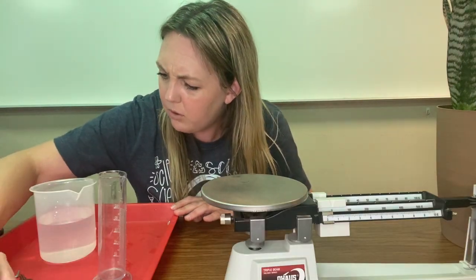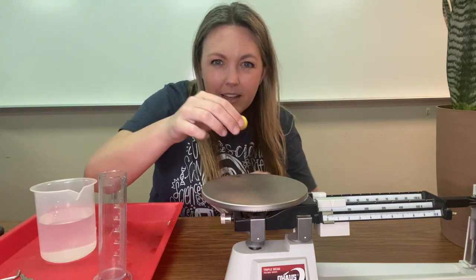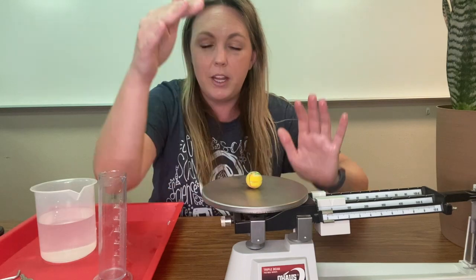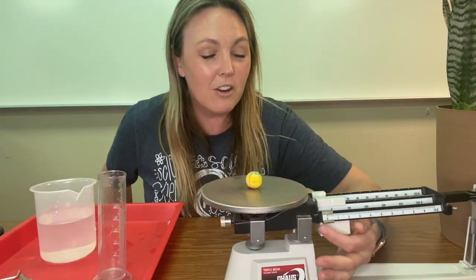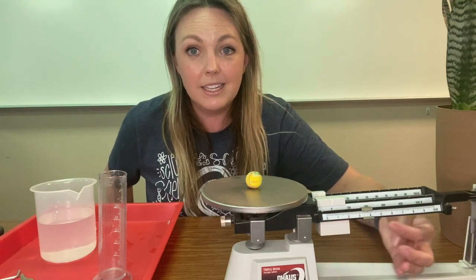How about this bouncy ball? Let's see if we can get it to sit in the middle of the tray. All right, so we start at the very beginning with the single digit numbers.